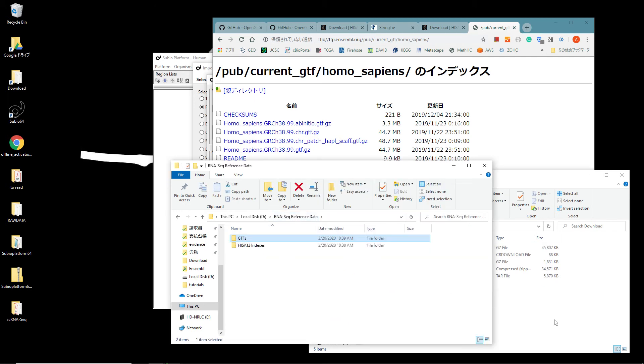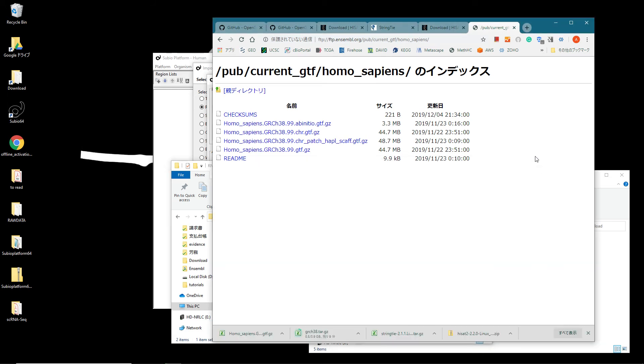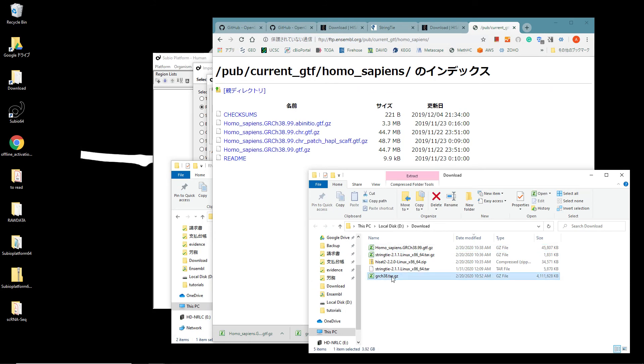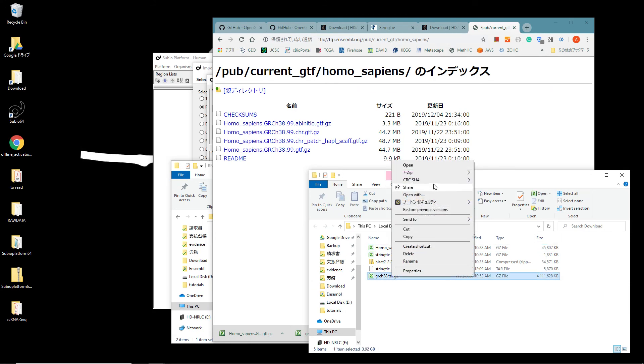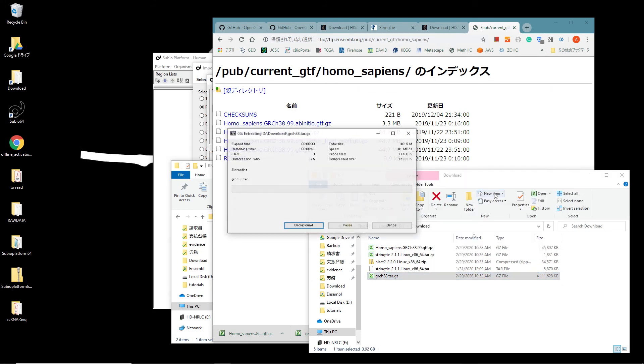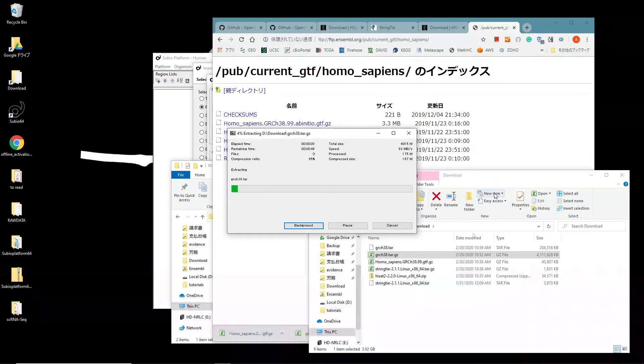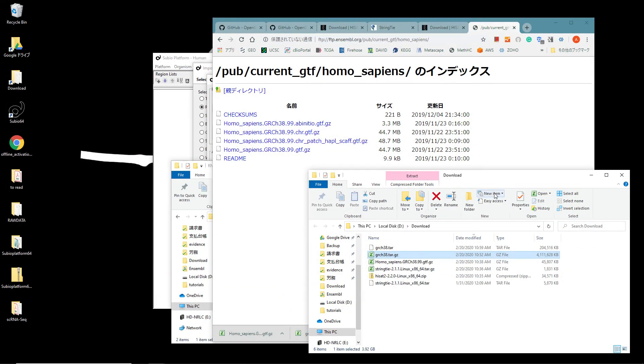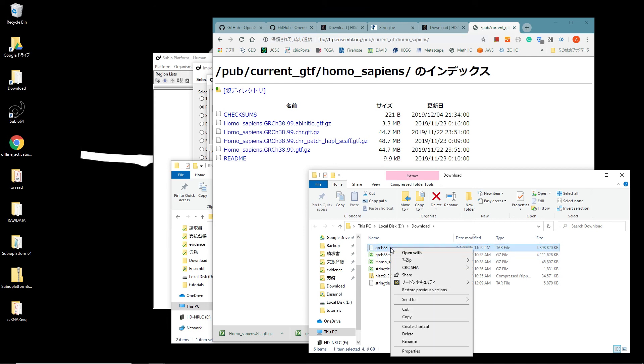Wait until the download of the HISAT2 indexes completes. Unarchive the .gz file and then unarchive the .tar file to extract the folder.